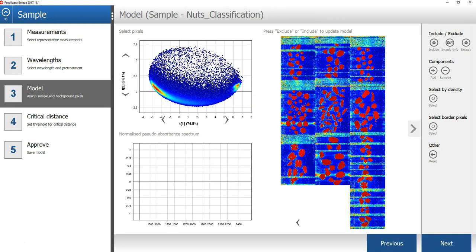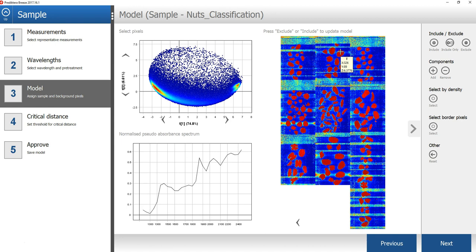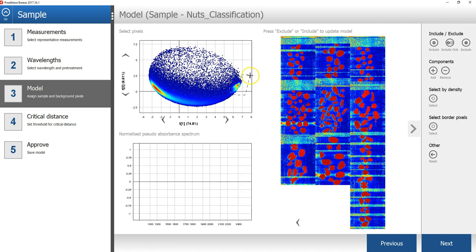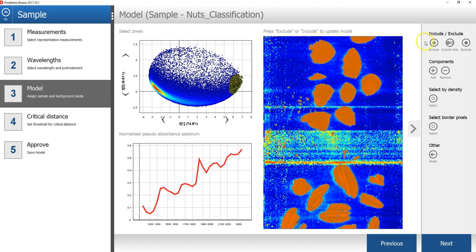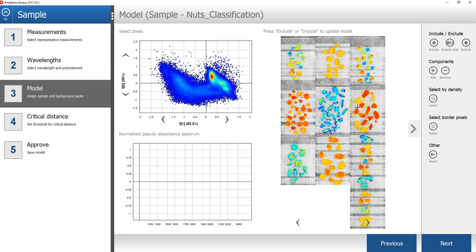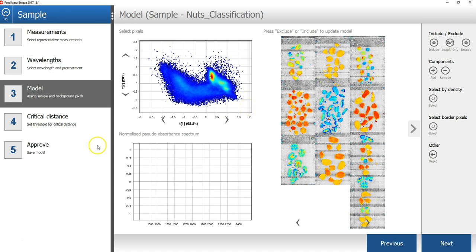A mosaic has now been created of the selected images, and a PCA model has been created from all the pixels in this mosaic. The goal is to select and include all the pixels that belong to the sample to make a sample model. If I select all points in the cluster in the scatterplot, I can see in the image that these pixels belong to the samples. You can use the mouse scroll wheel to zoom in. If I then press the include only button, the pixels from the background will be excluded, and the PCA model will be updated with only the sample pixels. To clean up the sample pixels even more, you can remove the border pixels around each sample object.